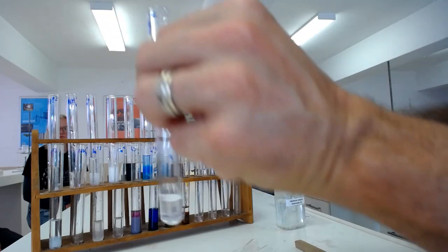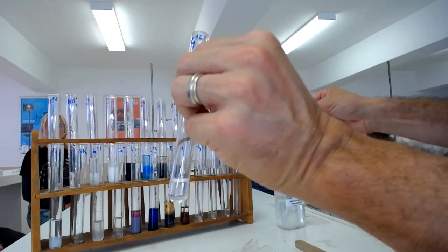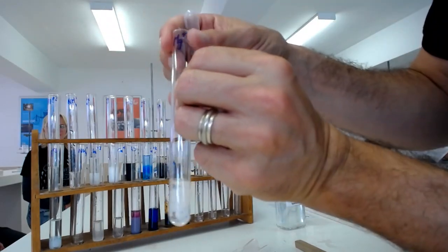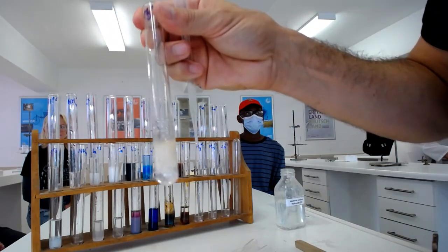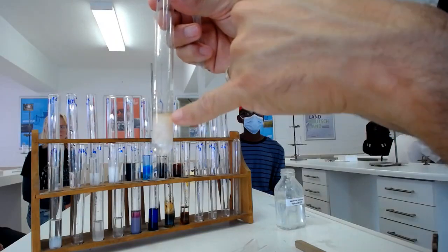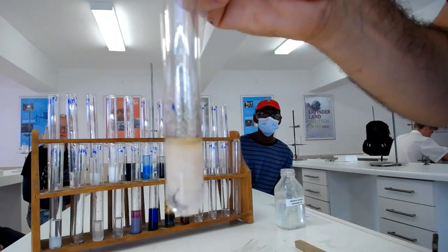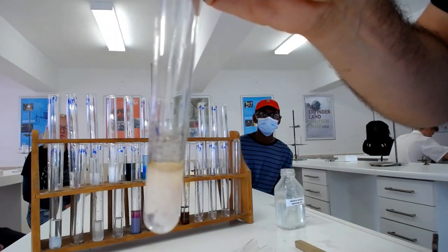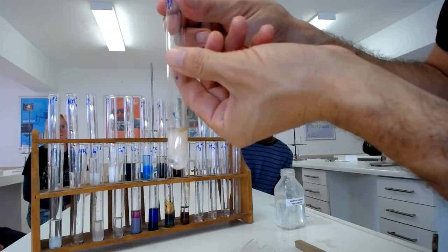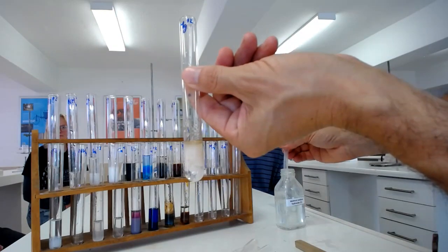Right, okay. So manganese. We're back to our group 2, so we expect a white precipitate, isn't it? Yeah. Oh, but what's happening? It says rapidly turning brown in contact with air. Yes, look at it. At the top there, it's turning brown. So a white precipitate forms and then it turns brown. That's just very cool. Is there something that happens if I add it in excess?